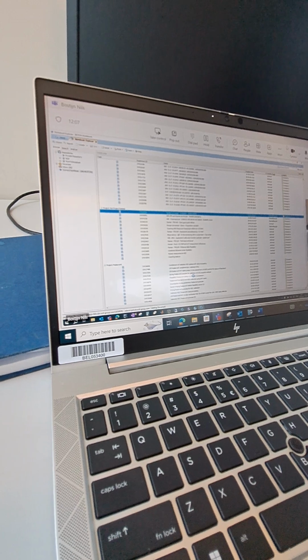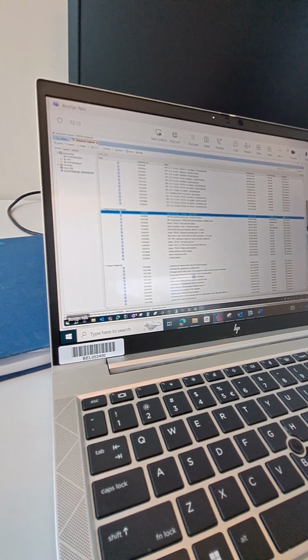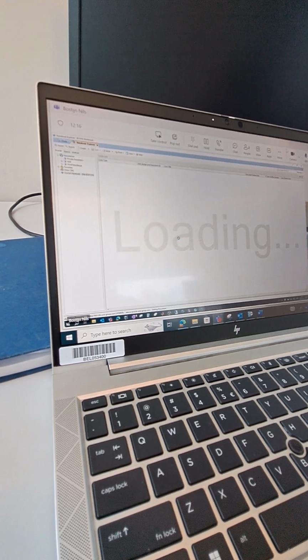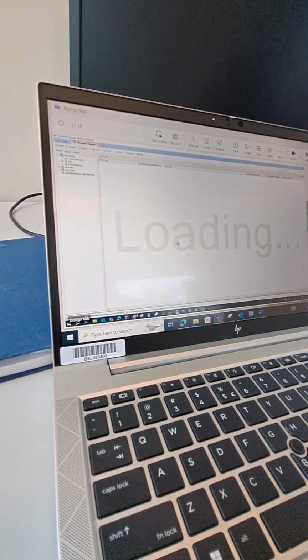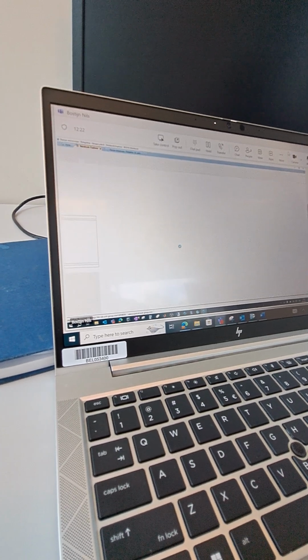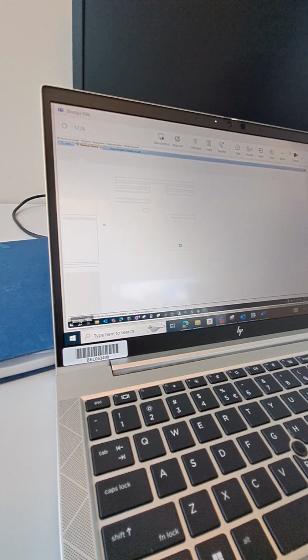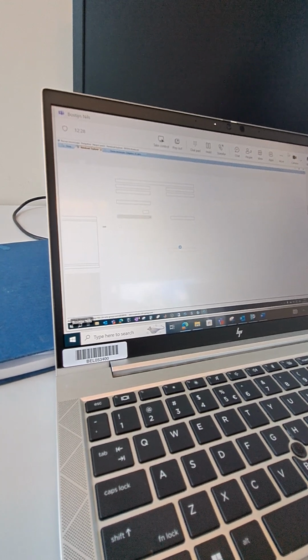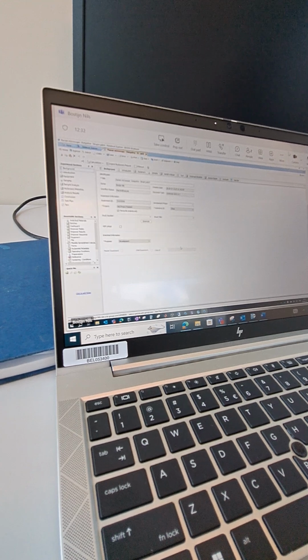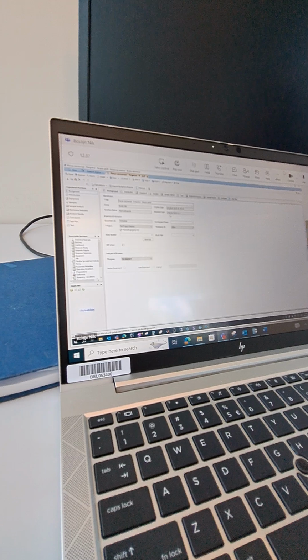Can I read any of it, just as a template, to see how the previous ones are filled in, or will I not have access? Yes, you will be able to look at the ones we have. But I will now focus on how one ELN looks, and then afterwards I will show you how you can search for an ELN and how you can navigate through the different ELNs of different people. Fine, that would be good.